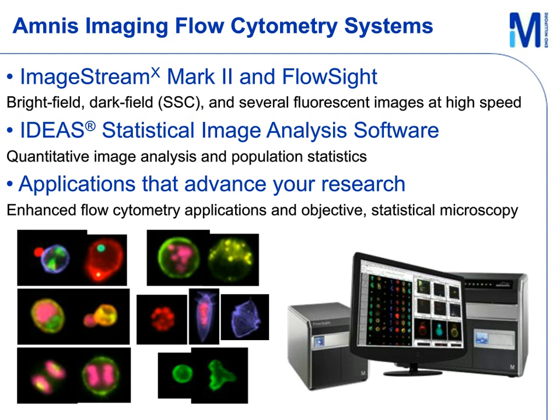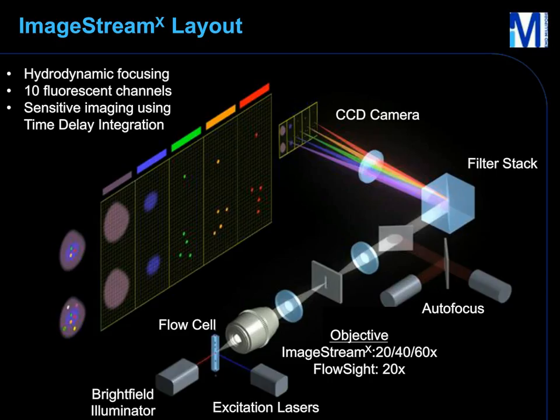For those of you from the pharmaceutical world, you may be familiar with flow microscopy, which is the method used by MFI and FlowCam. In many ways, imaging flow cytometry is similar to flow microscopy. However, there are some differences that give imaging flow cytometry some unique advantages. One of the most interesting differences is the ability of imaging flow cytometry to collect fluorescent imagery in addition to bright field imagery, which allows the use of fluorescent stains in order to identify particles and evaluate their chemical composition.